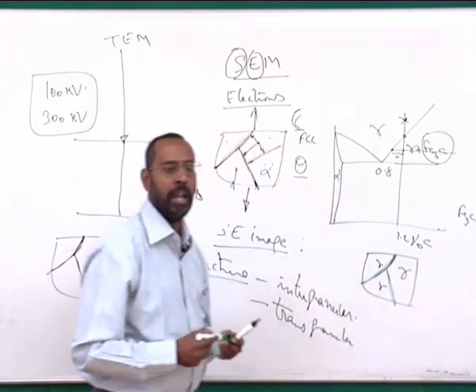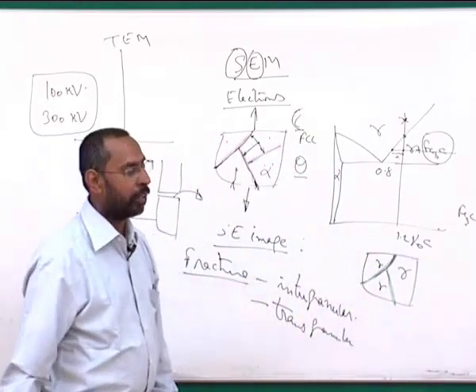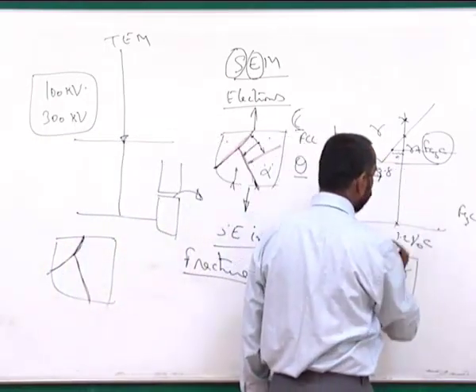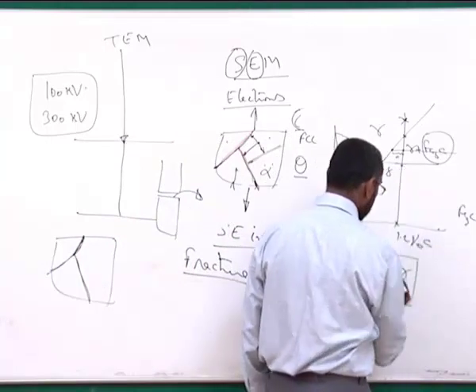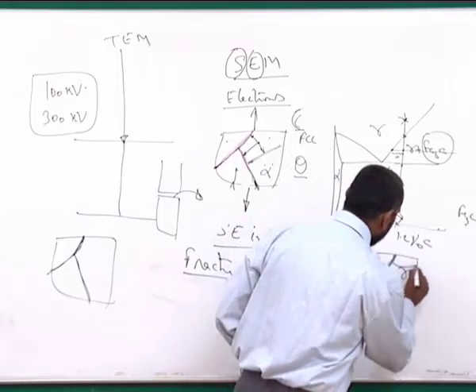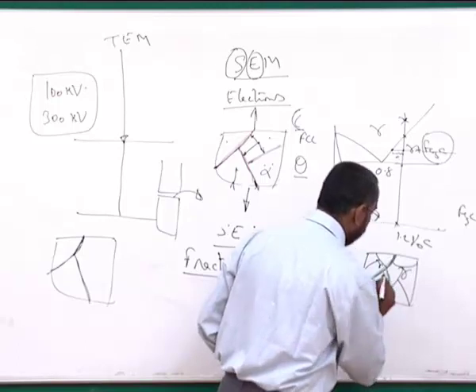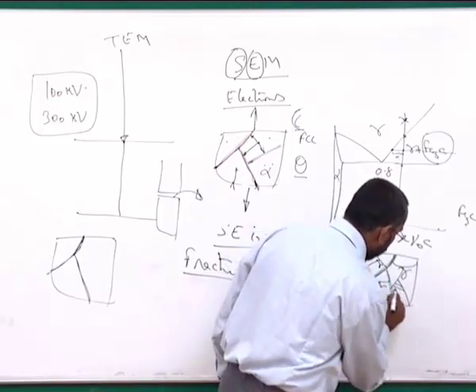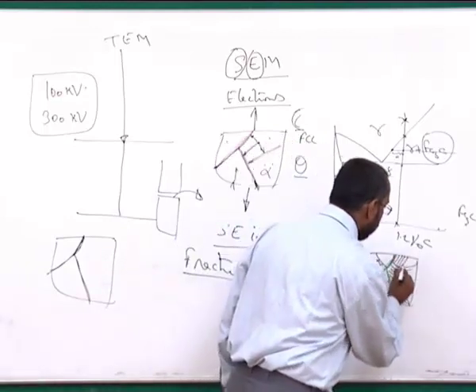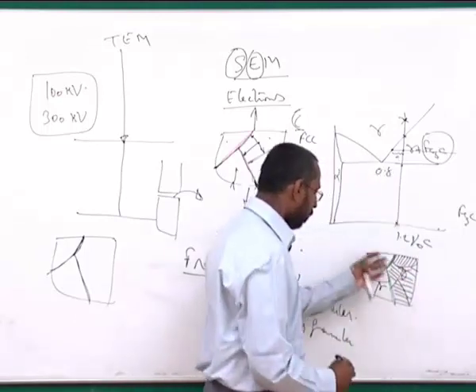Again, cementite being a brittle phase, you have a brittle phase nucleated at the grain boundaries and growing. And ultimately, when you come to room temperature, the remaining gamma undergoes a eutectoid transformation, and you will see a microstructure with eutectoid colonies, which are pearlite colonies, and inside the pearlite colony you have alternate layers of alpha plus cementite, which is what we call a lamellar structure, and similarly in other regions.